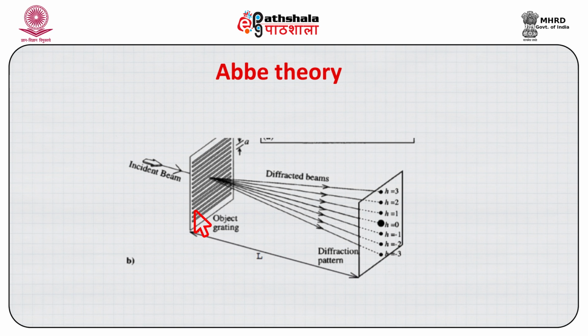If a is smaller than lambda, that is the wavelength of the investigating beam, sin phi will become greater than 1, which is not possible, and thus for diffraction to occur, this condition is not possible. If a is significantly larger than lambda, then the diffracted beam will be too close to the direct beam to be seen, and therefore, the two should be nearly similar.